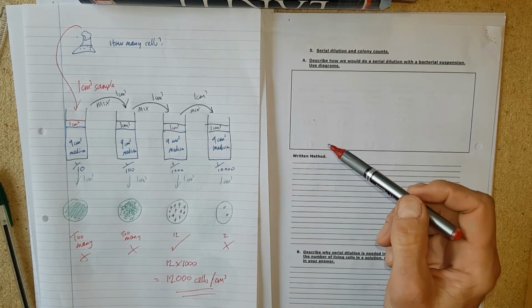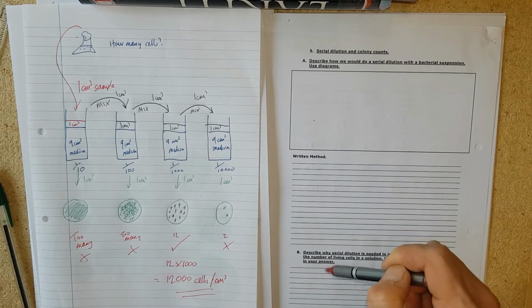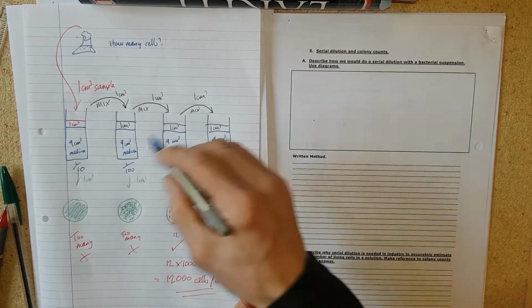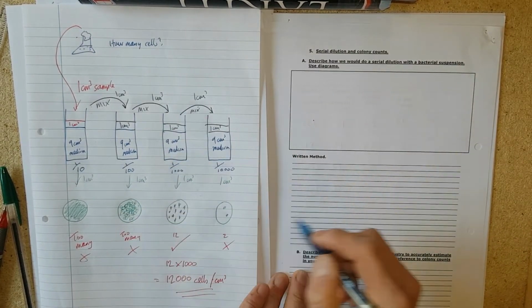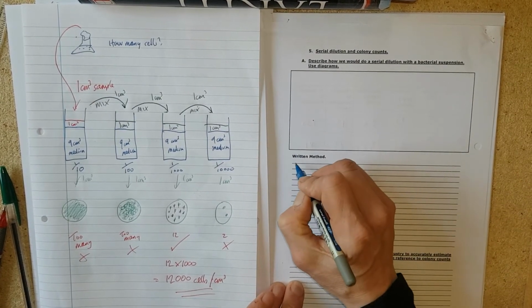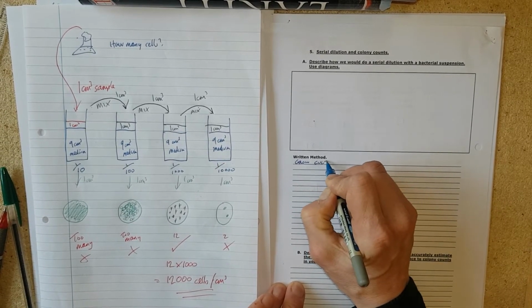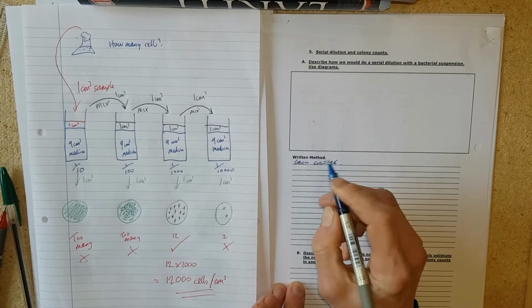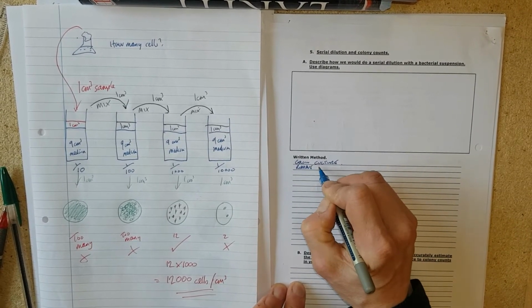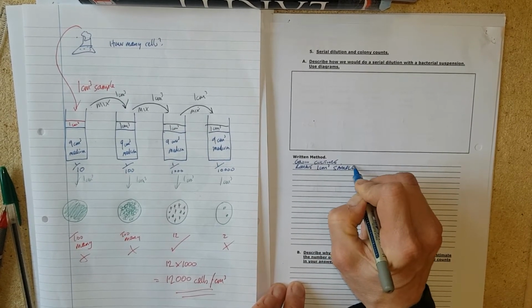So your written method is just to summarize this and say why we need to do it. So your diagram might be on a separate sheet, or you can fill it on here. So we've got grow culture. We're going to remove 1 cm cubed of our sample.